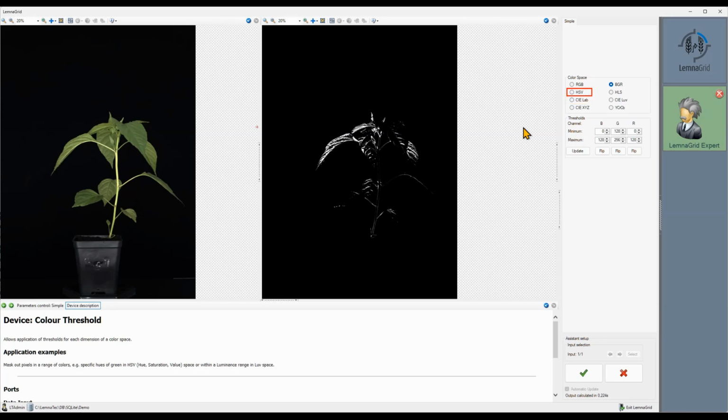This is different with HSV. It represents colors in terms of hue, saturation, and value or brightness. Value or brightness is pretty self-explaining. If the saturation is lower, then the color is more grayish, and if it's higher, it's less. The hue finally represents the bare color from red to green to blue and back to red. It is usually represented as an angle between 0 and 360 degrees.